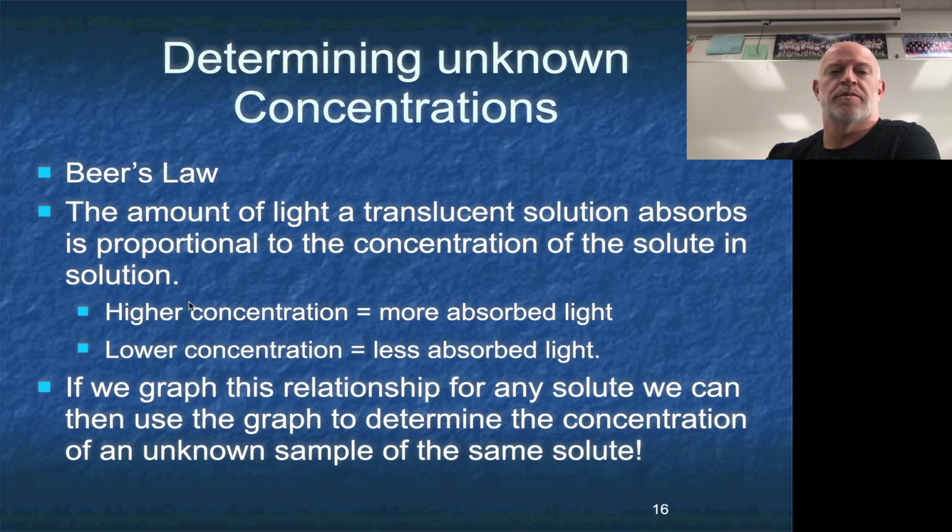Okay, today we're going to talk about a way to determine an unknown concentration of a solution. So let's say we have a solution and we don't know what its concentration is. Maybe we're in quality control for a company. Maybe we're just a consumer that wants to know how concentrated something is.